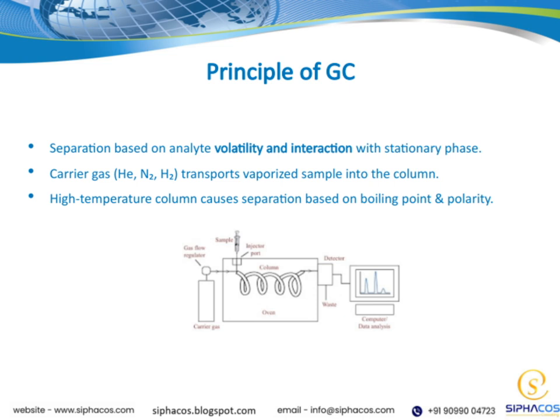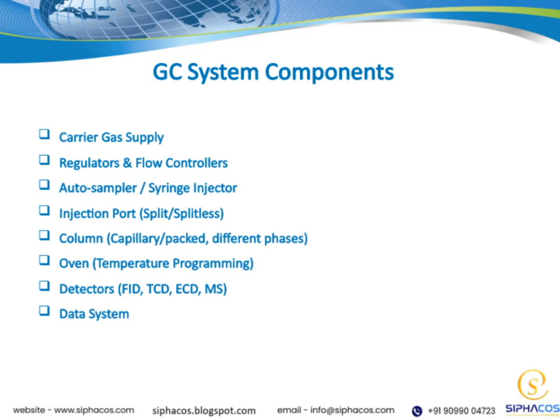All these principles come together to give us a powerful technique, gas chromatography, that allows us to analyze complex mixtures effectively. It's all about leveraging these physical and chemical properties to separate and identify the analytes with precision. Let's take a closer look at the core components of a GC system.